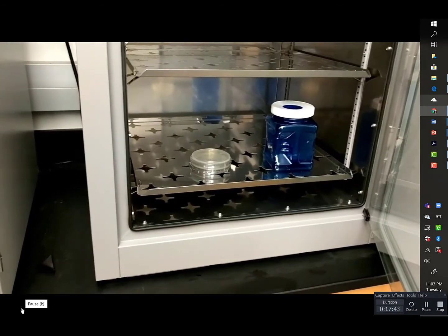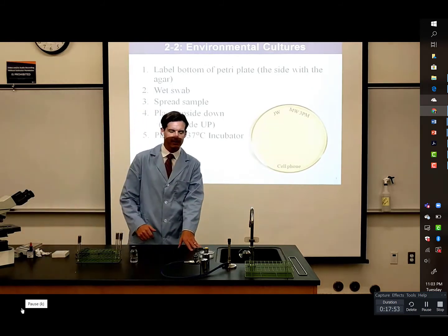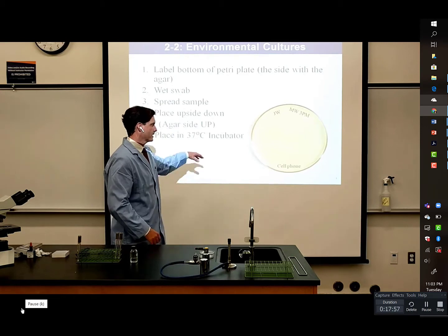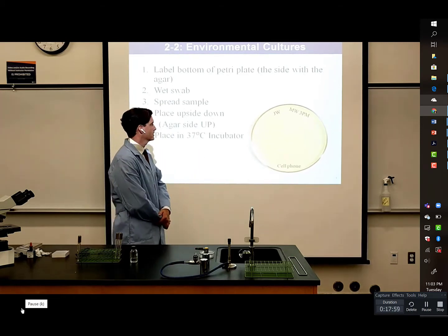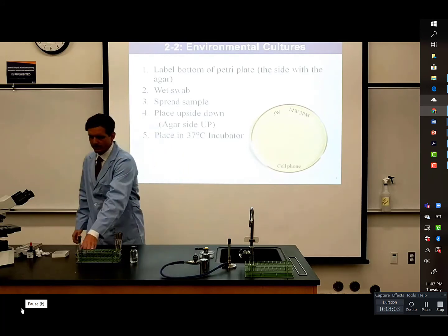Okay, now that we have our environmental cultures in the incubator, this one still has to be out for a little bit of time, the 20-minute air sample. But we have all the other ones in the incubator. I'll put that one in just a little bit. We can move on to our next topics.